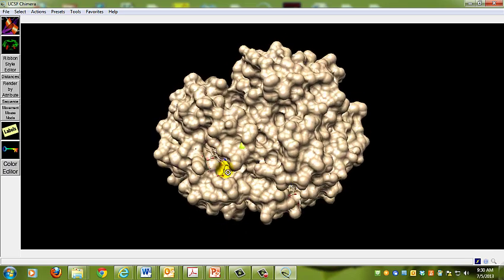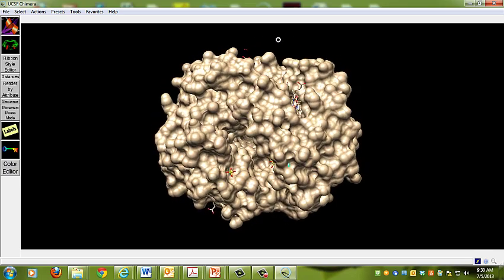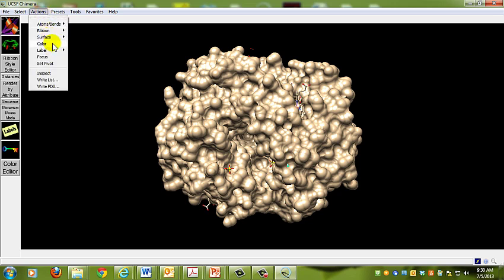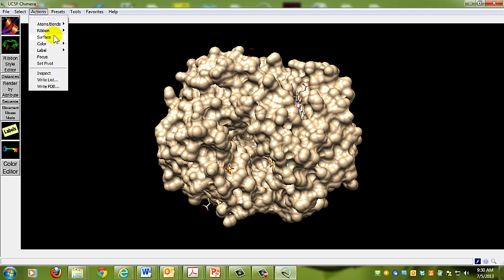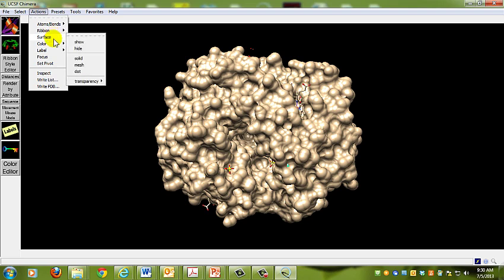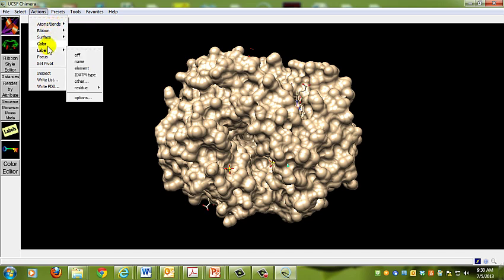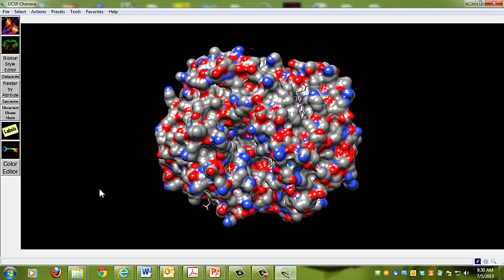Now let's go to actions, surface, atoms and bonds. We're going to go to color by element. When you color by element, it colors the oxygens red.